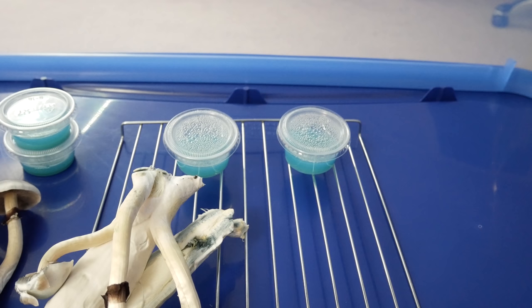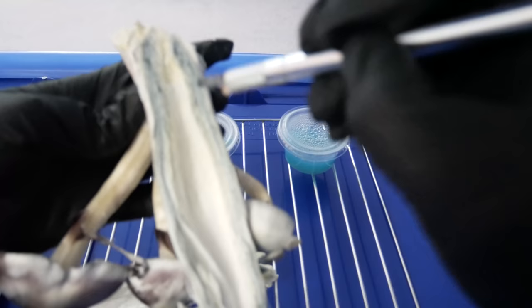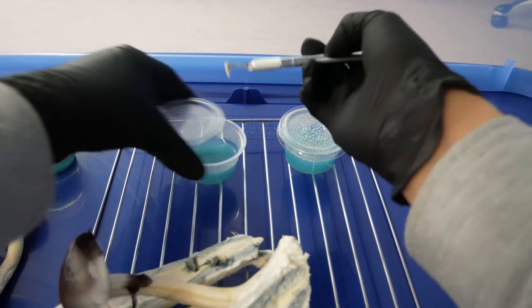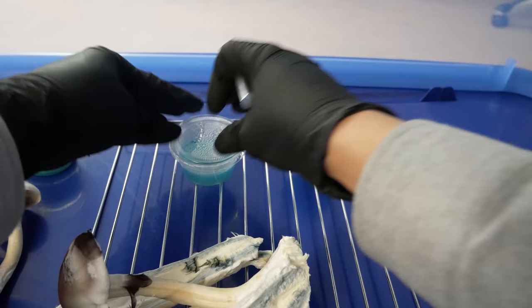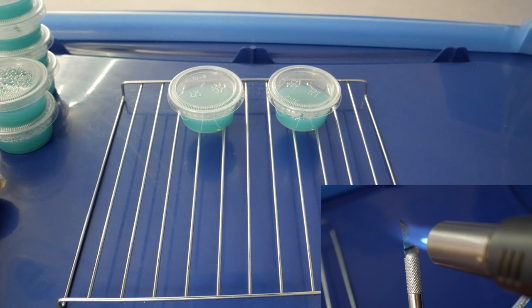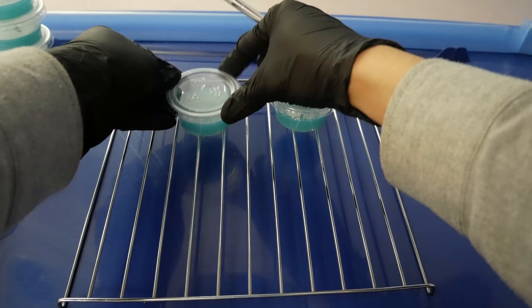And again, we'll flame sterilize our blade. Right on the agar. Here I'm sanitizing my hand with isopropyl alcohol before I handle this fruit. Go ahead and flame sterilize my blade. I'll loosen up my agar cup lids here.